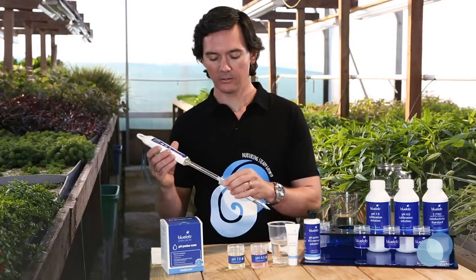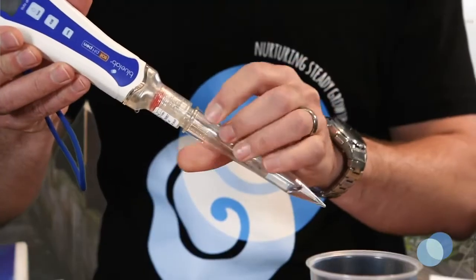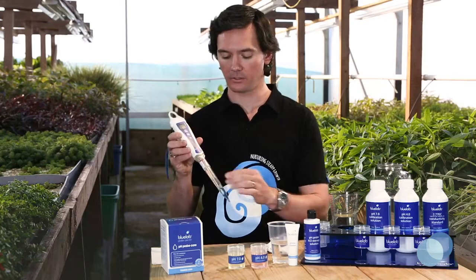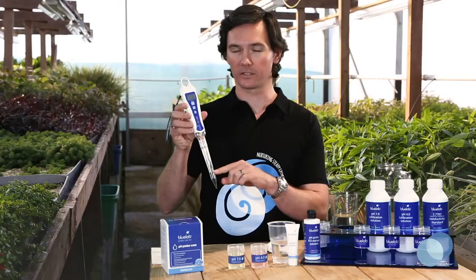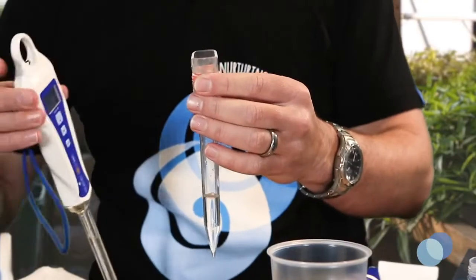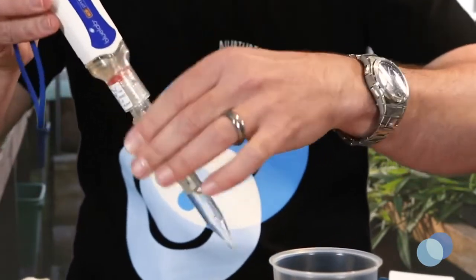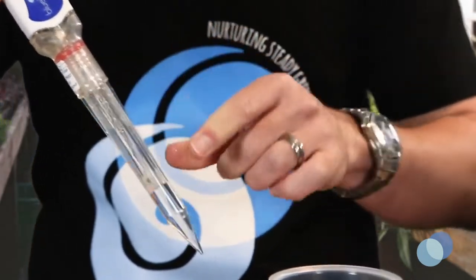To store your Bluelab Soil PH Pen, gently slide the probe cover back on the pen until it touches the bottom. Carefully screw the diver into the storage cap until it's sealed, but not too tight. Check that there's enough KCL storage solution inside the storage cap to fully cover the probe tip when it's closed. If not, remove the storage cap and add a few drops of KCL storage solution and replace the cap. Then you're ready to store your probe.